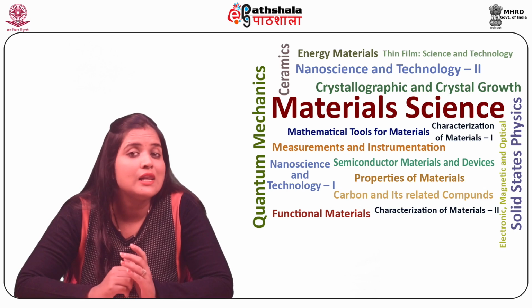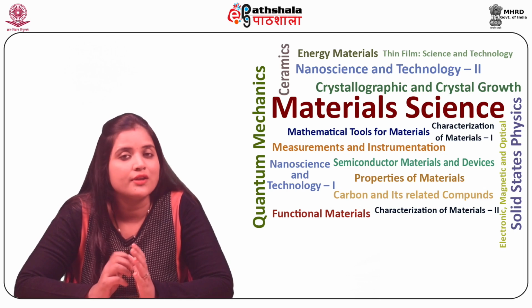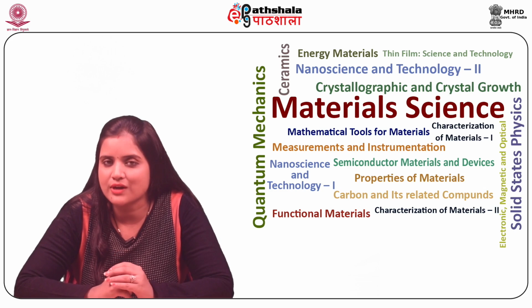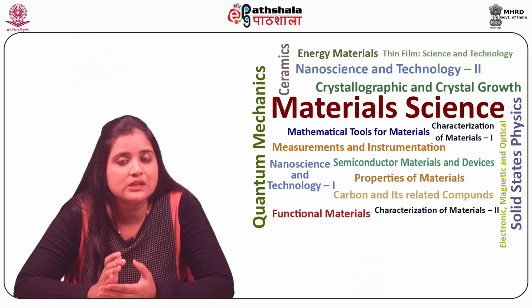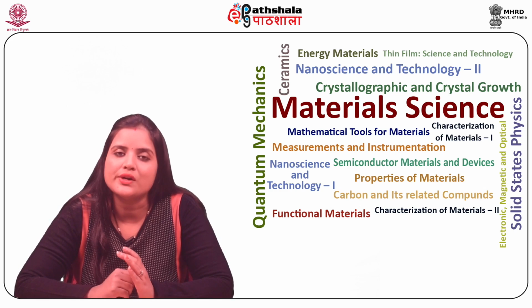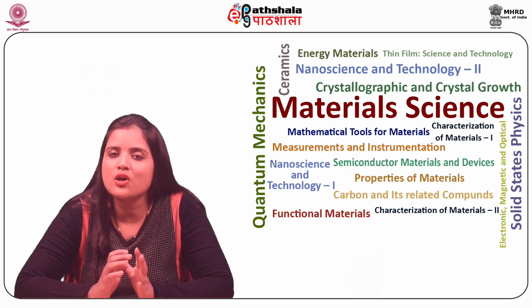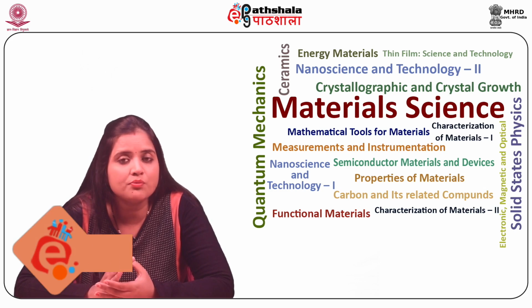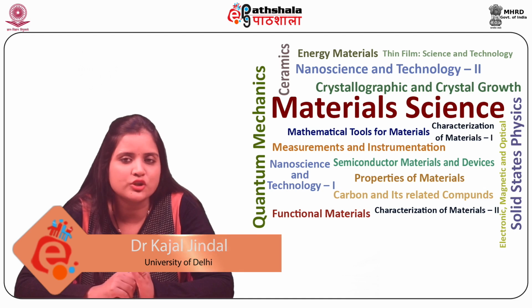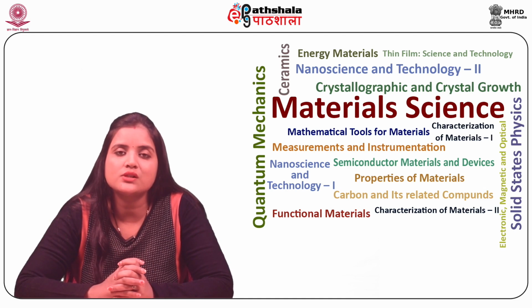So students, let us now summarize what we have learned in this module. In this module, the concept of the oil immersion technique was described. The various properties of immersion oil and the effects on the optical system were discussed. The objective, advantages, and disadvantages of oil immersion microscopy were discussed in detail. Finally, quantitative metallography and its methods were studied. Thank you, students, for your attention.